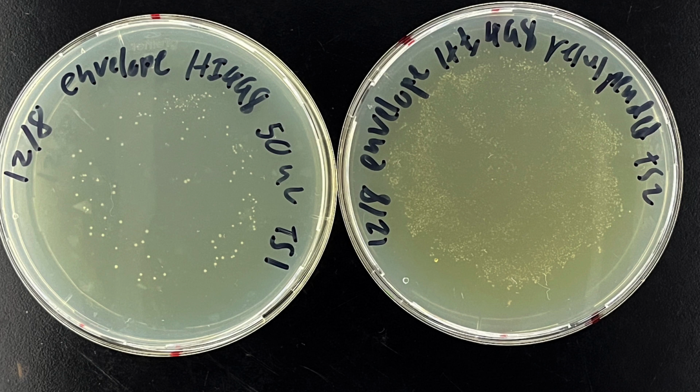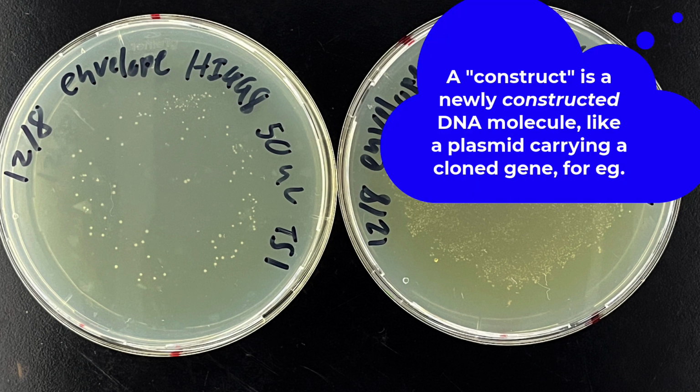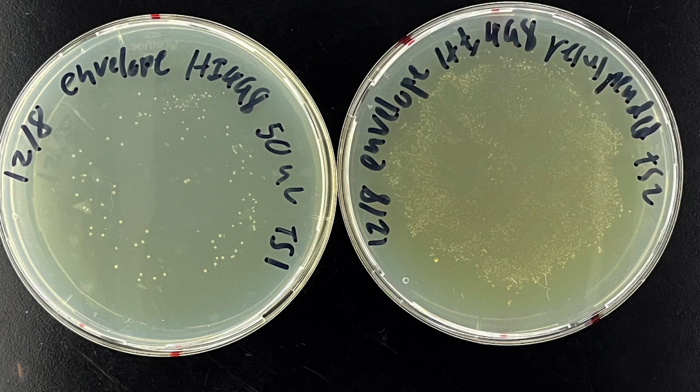And theoretically, each of these individuals can have a different construct or just a different way that things were cloned in there. So generally, when we screen things, we'll pick multiple clones to screen for the presence of our properly formed plasmid or properly cloned gene. The amount that we screen will often vary on the types of cloning that we've done. The much more efficient, higher success rate cloning, we need to screen less because we expect most of these to be the correct construct. The ones that are a bit more challenging, sometimes we'll have to screen more just to make sure that we find it.